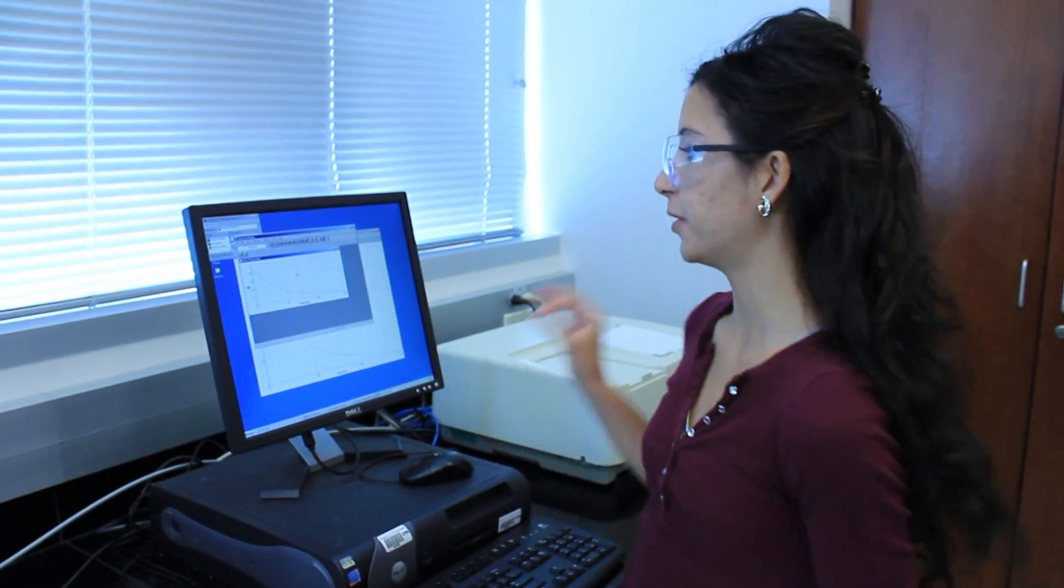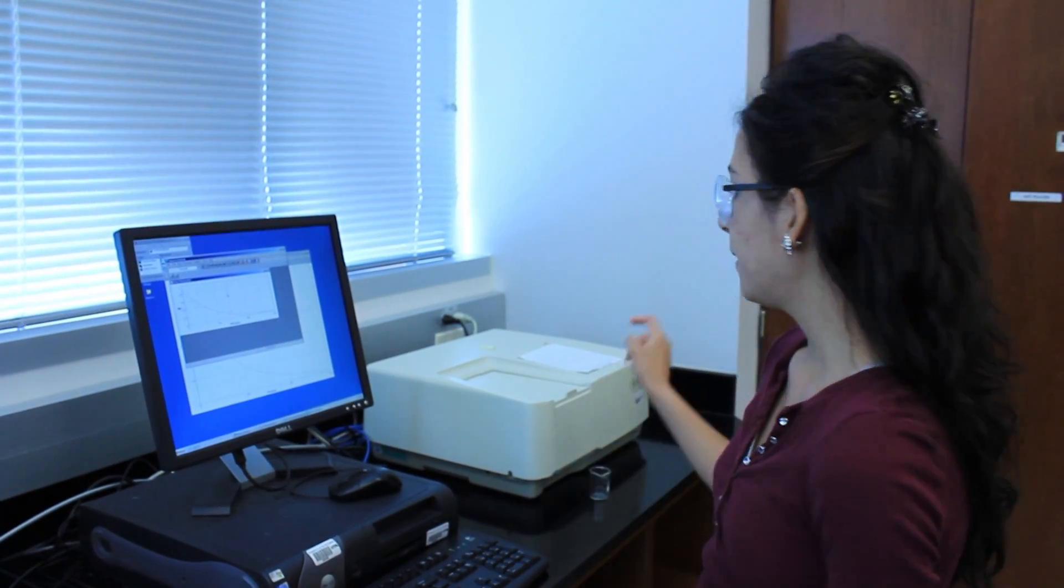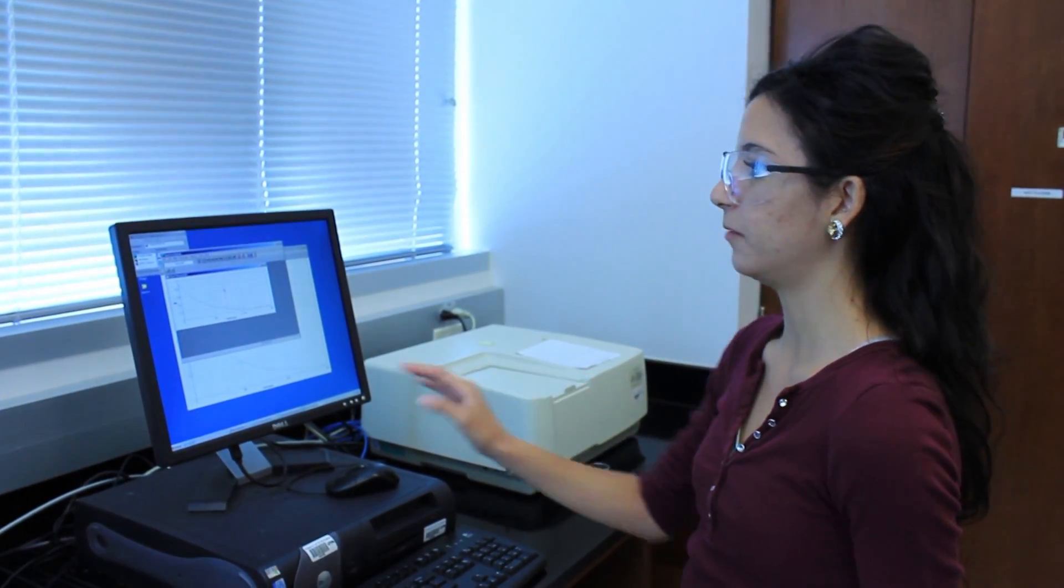For the second trial of this section you're going to use 10 mils of your brilliant blue and then 5 of your bleach diluted to 10 mils. So it's 10 mils of brilliant blue and then 5 bleach plus 5 DI water. And then you just put that cuvette where you mix again quickly because the bleach will take care of the blue dye and that will just go away. So you have to work really fast there. Put that in and run through the exact same way. Take the same points and you'll end up with two sets of data points.